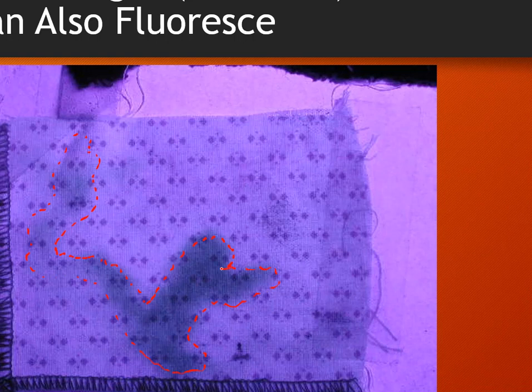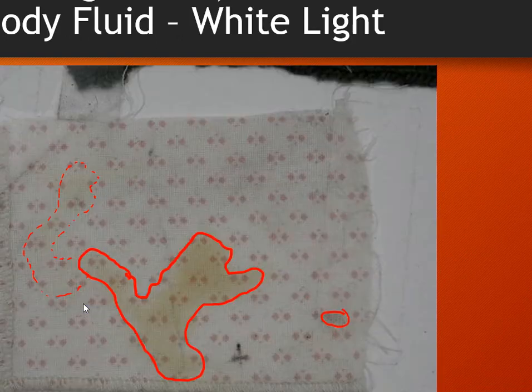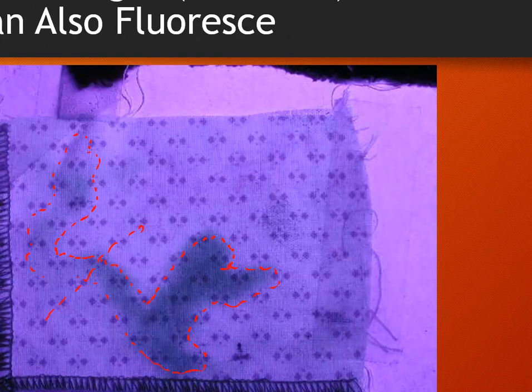I mean, this was not surprising. The difference is that I can kind of see it better, right? I can see the stain a little bit better. This area over in here in the beginning, that area was guesswork. I wasn't really sure. It looked like something, but I wasn't completely positive about it. And now when I turn on a UV light, that image shows up a little bit better.